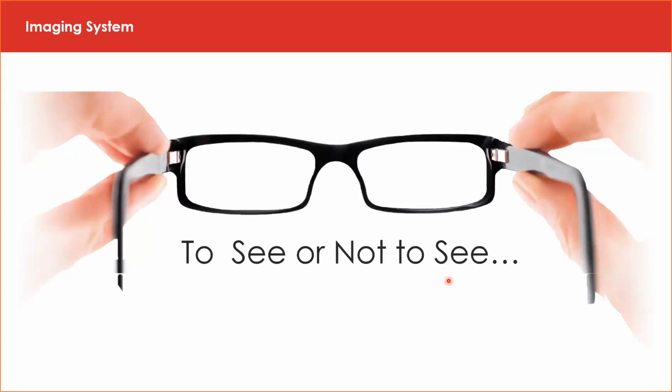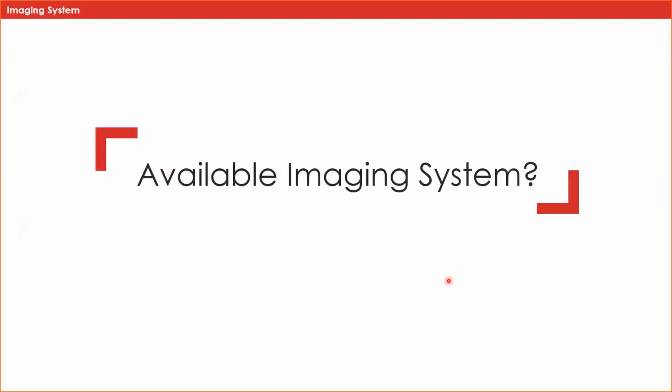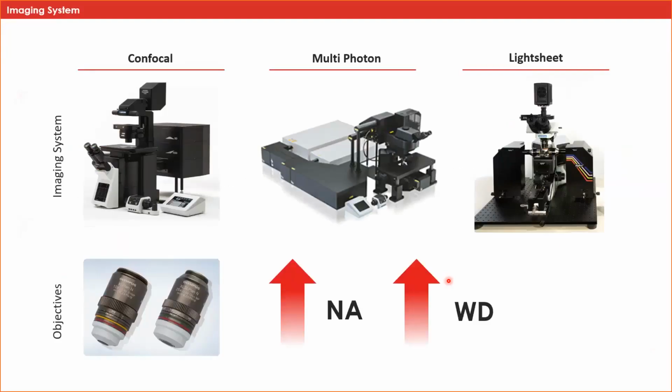However, unless you have a microscope system that can perform in-depth imaging, it won't matter how well your tissue is cleared. So our next areas of conversation generally concern what your available imaging systems are, because if you don't have an imaging system such as a Confocal, a Multiphoton, or a Lightsheet, or an objective set that has a sufficiently high numerical aperture and deep working depth, it really won't matter.